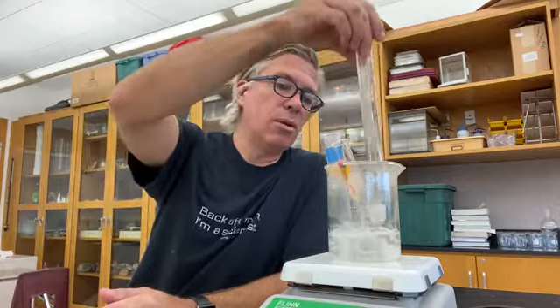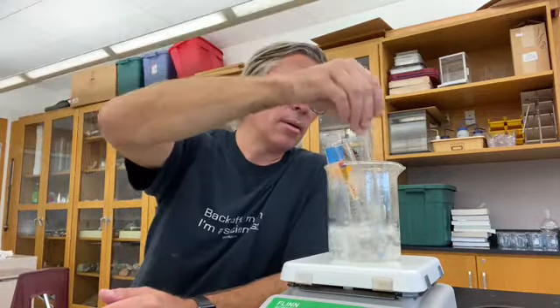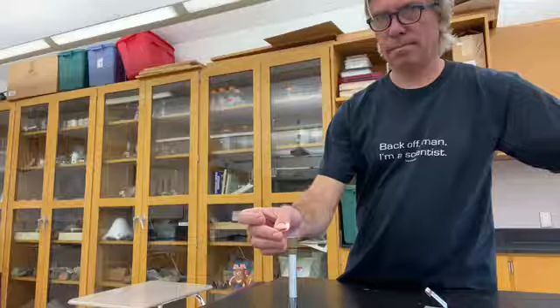These small samples have been in the boiling water bath for about 10 minutes, and I wanted to see if they would melt at 100 degrees Celsius. So copper sulfate, no, but it has gotten a little whiter. Dextrose, nope. Zinc, nope, that's hot. But the paraffin has melted. The white, waxy looking solid has melted and turned into this liquid that's at the bottom.